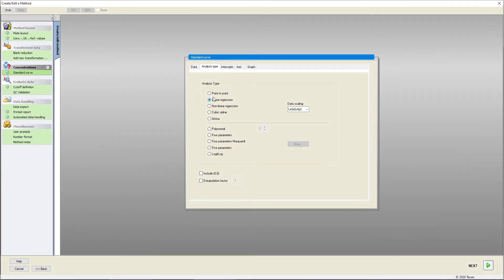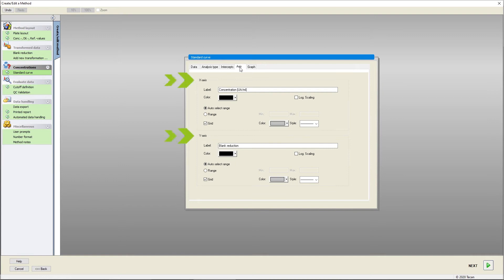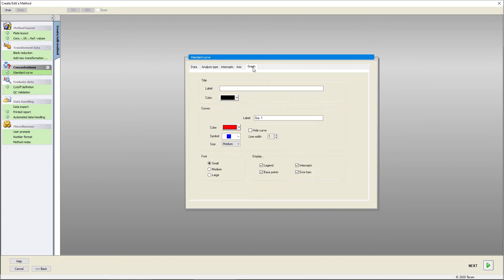Define suitable X and Y axis properties. Magellan also lets you choose log-scaling for the axes. You can change the parameters of your graph, including the title, curve appearance, or font.